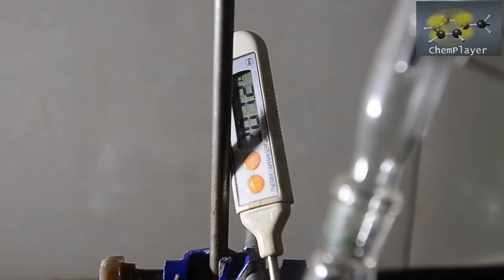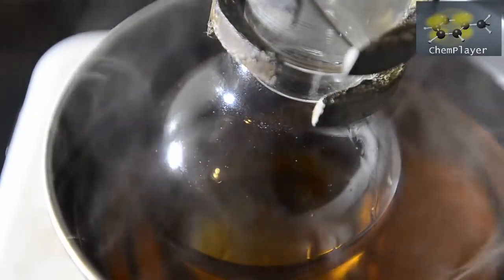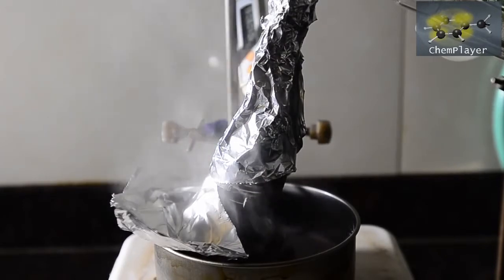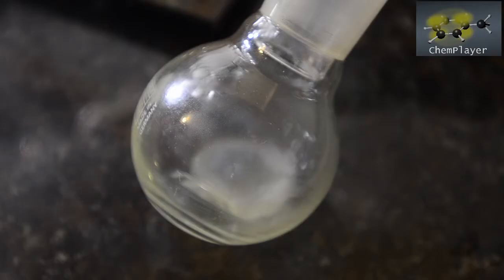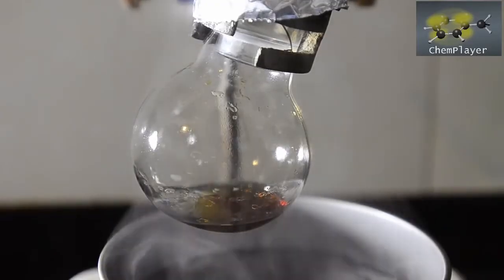The joys of using baby oil in an oil bath. Once the temperature got to above 200 degrees we saw some more boiling in the flask. We covered the still head with foil to insulate it and help distillation. The vapor temperature rose quickly to about 200 degrees C. Once distillation of this fraction had completed we were left with an orange liquid which wouldn't boil off. So we allowed the apparatus to cool.